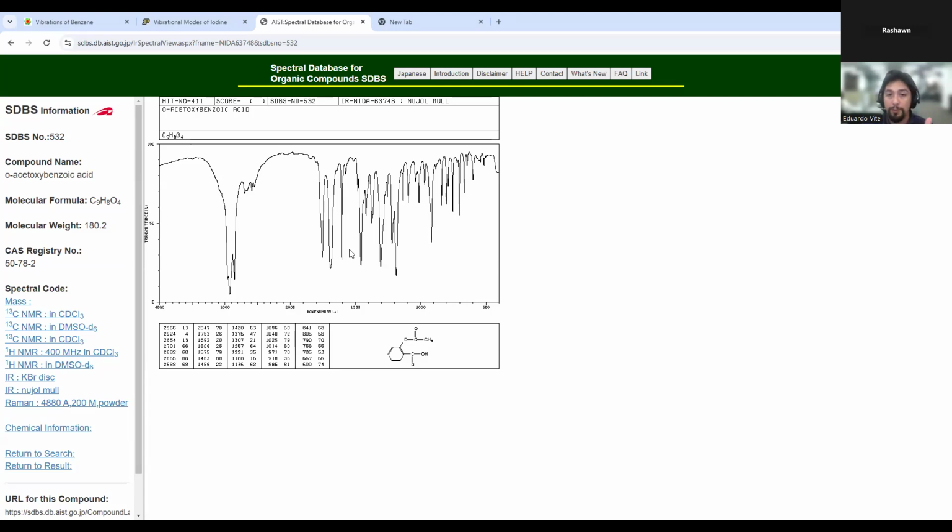If you're trying to convert something to a carboxylic acid and you see this pattern, you're like, well, that looks beardish enough that I'm convinced there is a carboxylic acid there. But if you're just looking at it blindly, it's kind of hard to tell, and this is very distinctive.